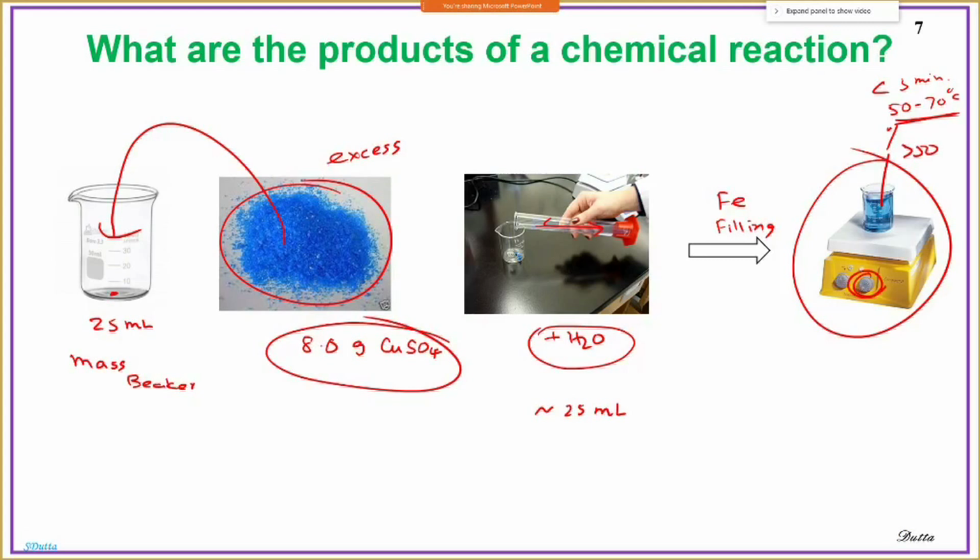So there is a setup, and the setup is like here. So you have 1, 2, 3, 4, 5, 6, 7, 8 and so on. I would start, maybe I'm going to set it at 3 first. And wait 1 or 2 minutes. I'm not going to touch it. I put my finger close to this and I will feel the heat. If I don't feel heat, then I'm going to turn up a little bit more to 4. Otherwise 3 should be enough. And then you turn off, turn off to 0.